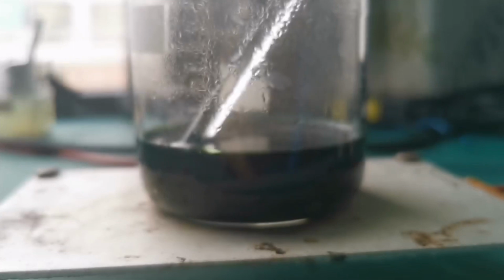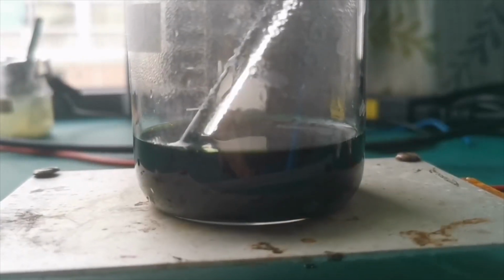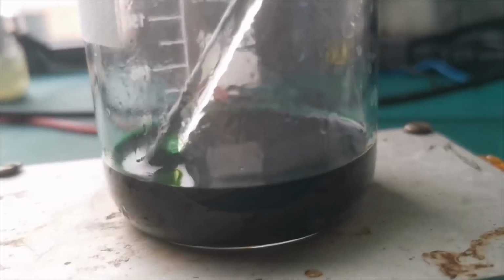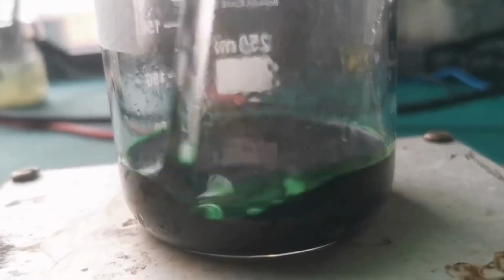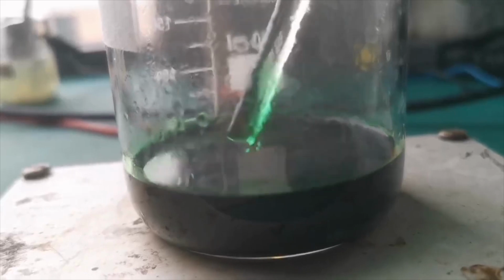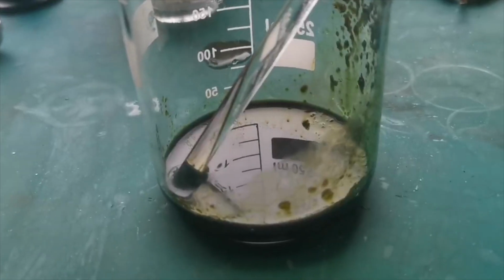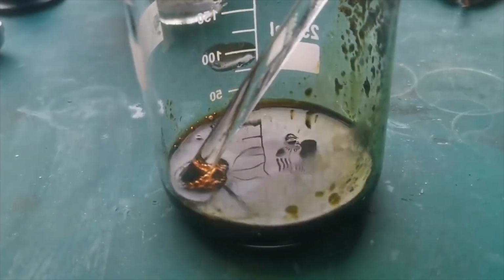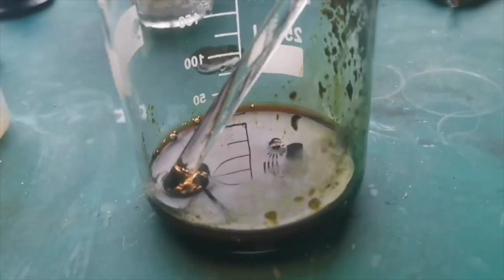Apart from the abnormal color of my cobalt chloride product, I also noticed a few weird phenomena when dealing with the mother liquor from the crystals. When I boiled it down, the solution displayed such a dark green color that I mistook it for a concentrated copper chloride solution. I then tried to add some water back in it, and all of a sudden, the solution reverts to the normal pink color, which was really surprising.